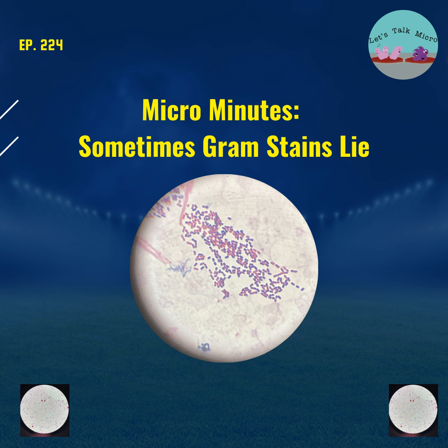But what if you go through your process and you're expecting something, for example based on the history? You're performing your Gram stain expecting, let's say, Gram positive cocci, and all of a sudden you put that slide there and you see Gram negative cocci. Or you are expecting a Gram negative and after you go through the process, you see a Gram positive on your slide. With the repetition and the process, you know that something is off. So, what are some things that can affect your Gram stain, so that even though you are looking at something on your slide, the information you're seeing is not accurate?